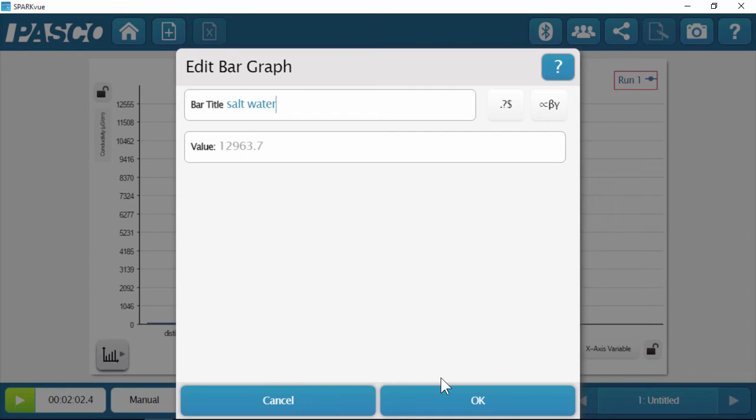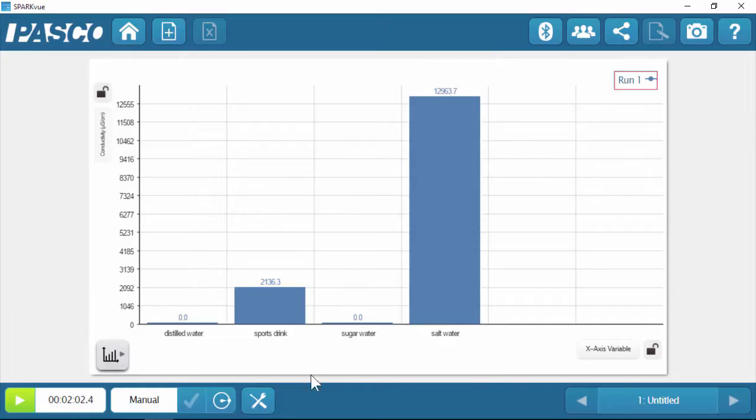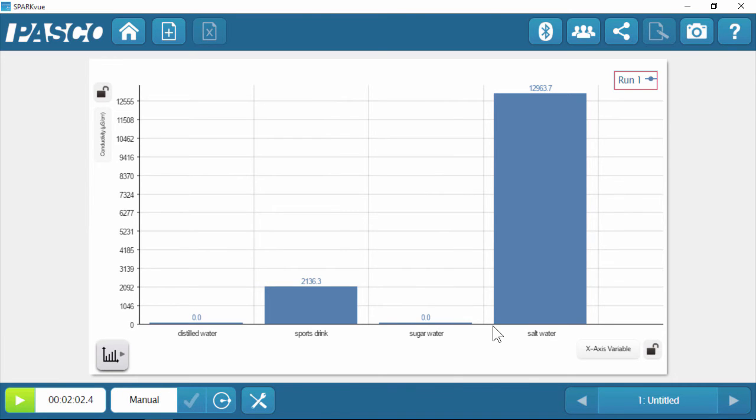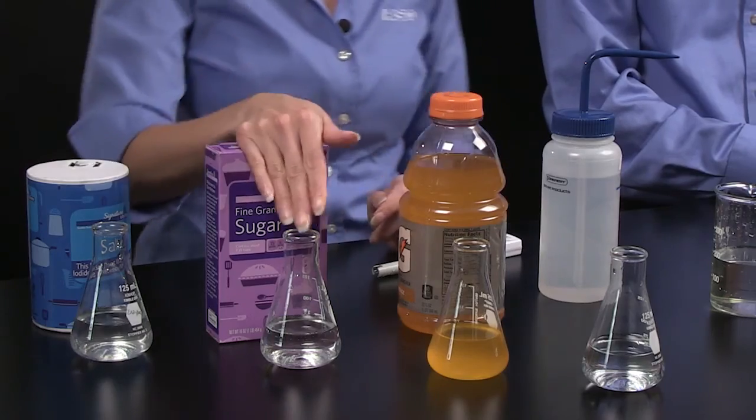I'm going to rename this bar to salt water and clean the sensor before putting it away for storage — I also like to dry it off before storing. Looking at our data, what caused the conductivity in the sports drink? It definitely was not the sugar, because that did not change the conductivity. But the salt really did change conductivity. When you put sugar into solution, it does not split apart and form ions because it's covalent. But when you put salt into solution, it does split apart into separate ions, and those charged particles conduct electricity as measured by our conductivity sensor. We were able to do a very simple, easy experiment with this wireless conductivity sensor right out of the box. For more experiment ideas, please go to pasco.com/wireless.